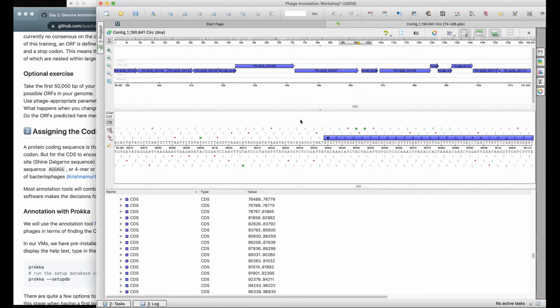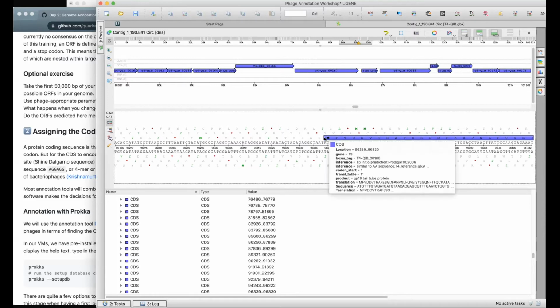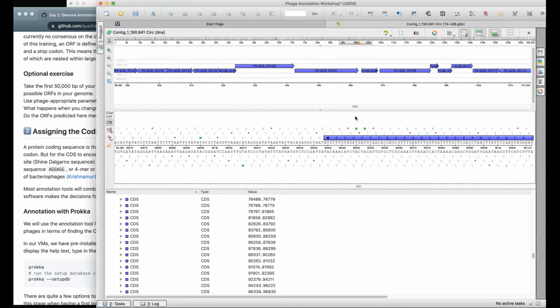And some of this is down to people's own personal feelings. And the only way to legitimately say what the correct answer is, is to do RNA-seq. So maybe the debate for this versus this is not worth it in this case because it's such a small extension.